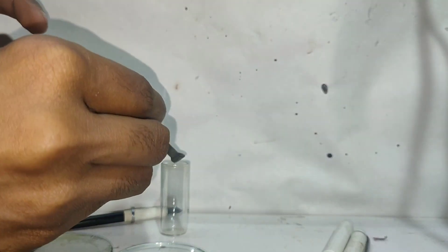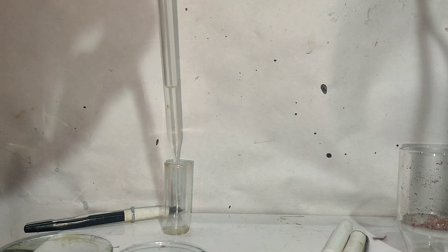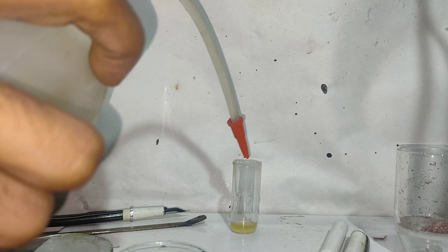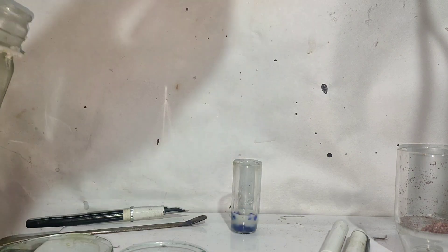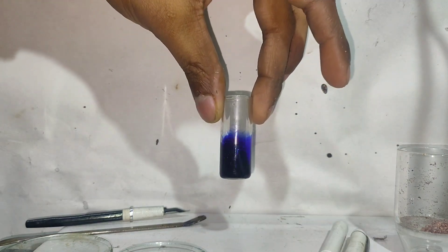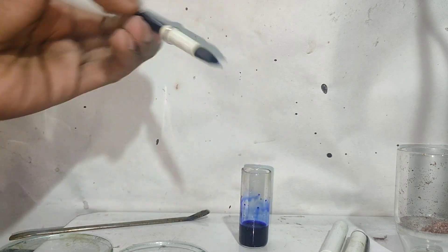Now for making disappearing ink. I took a few crystals of thymol phthalein and dissolved them in alcohol. Then I added an equal amount of distilled water. To this solution, I added 1 drop of 5% sodium hydroxide solution and it turned to a dark blue colour. Our disappearing ink is ready. Now I filled this ink into a fountain pen.